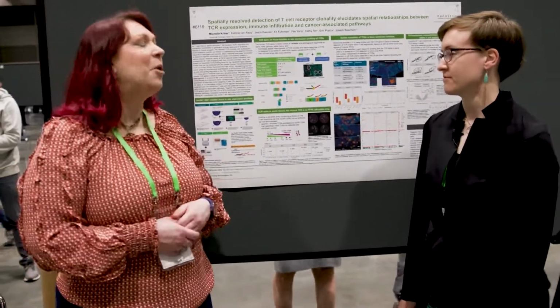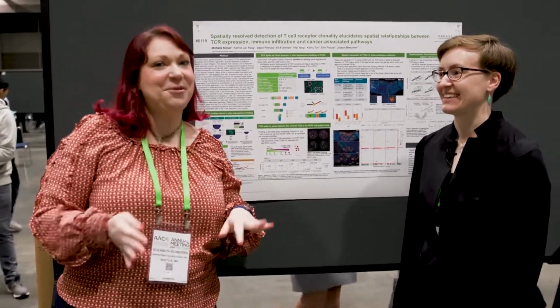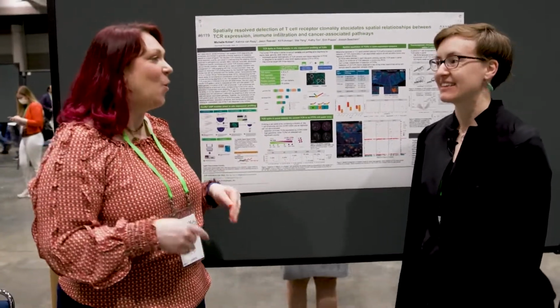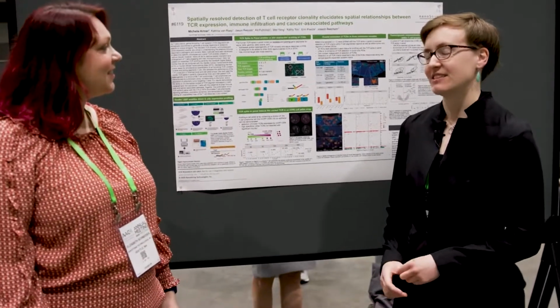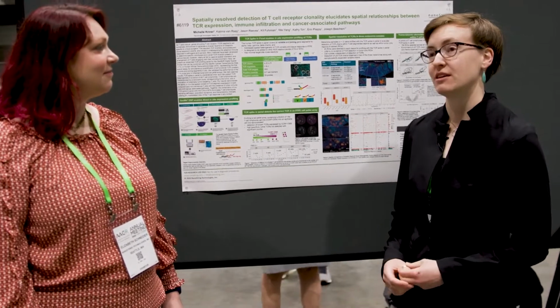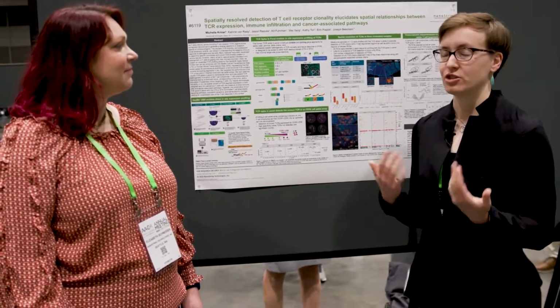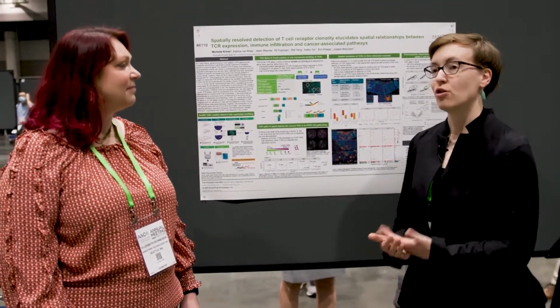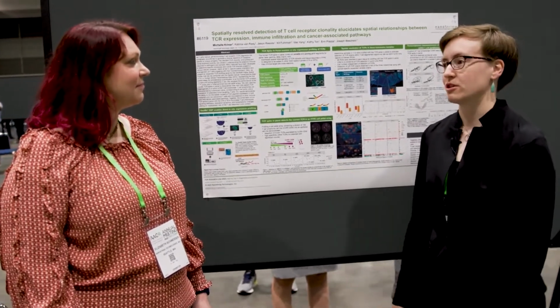So you mentioned a couple acronyms like WTA and CTA, and I know here at Nanostring we love our acronyms, but if you could let everyone watching know, what do those acronyms stand for? Yeah, so the CTA is the Cancer Transcriptome Atlas. It's a panel of between 1,800 and 1,900 genes enriched in content or genes that are relevant for cancer and immunology. And then the Whole Transcriptome Atlas, the WTA, covers the entire human transcriptome.